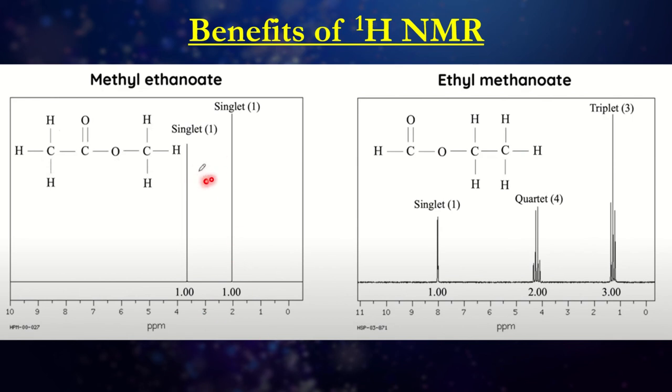We can see that over here for methyl ethanoate, there are two hydrogen environments. So the two environments that we see here is this one here. So this one environment, we'll just circle like that. That's the one environment. And then this is our second environment, sorry. So that's our second environment bonded to a carbon. Our first environment is bonded to an oxygen. So that's one, that's two.